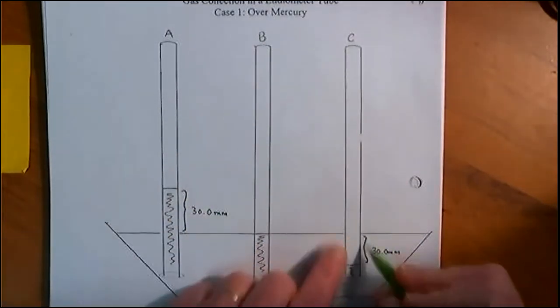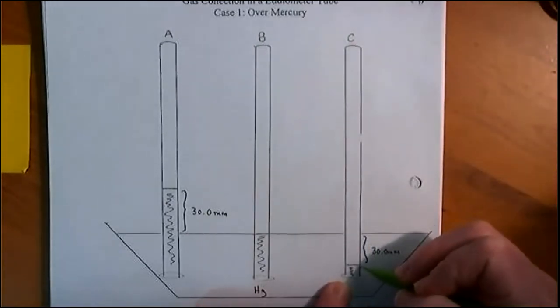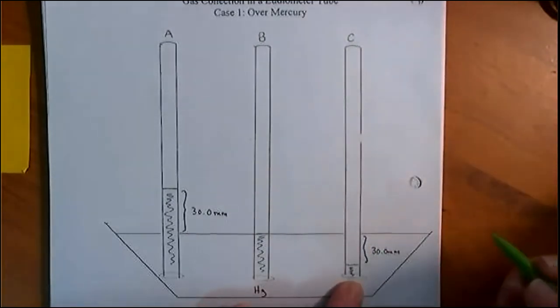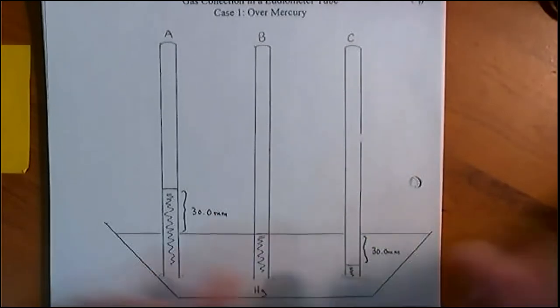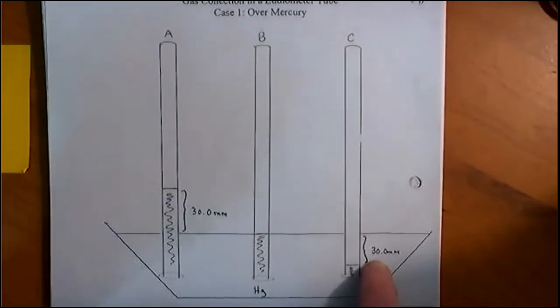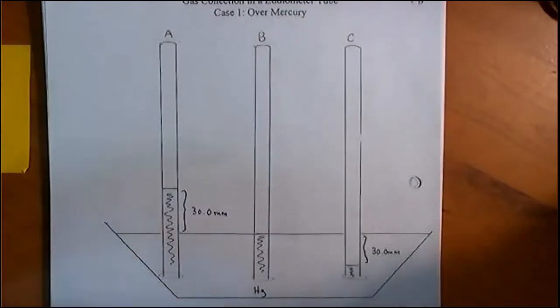And then the opposite is seen here. Imagine we almost filled it, just a little bit is still filled with mercury. And if we could measure 30 millimeters below the surface, it's just for sake of comparison that we chose to call this 30 and 30. So just imagination, they could be all kinds of different measurements.